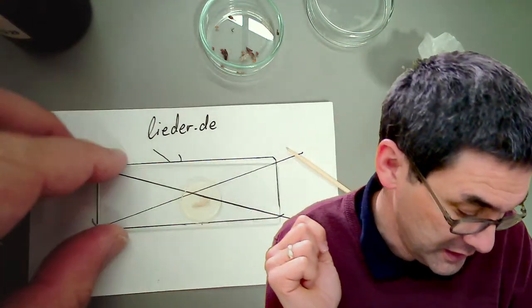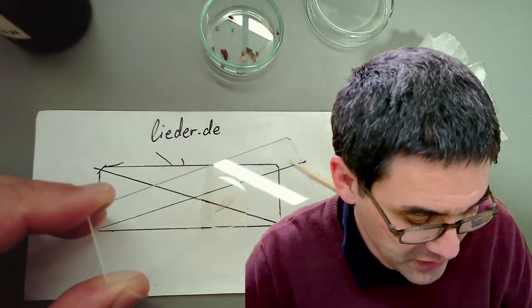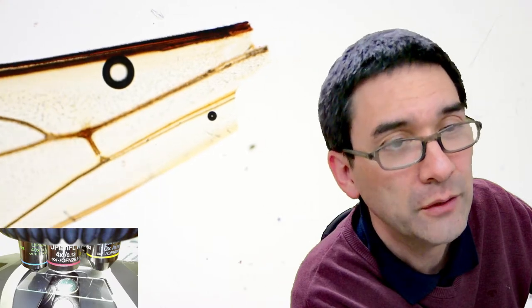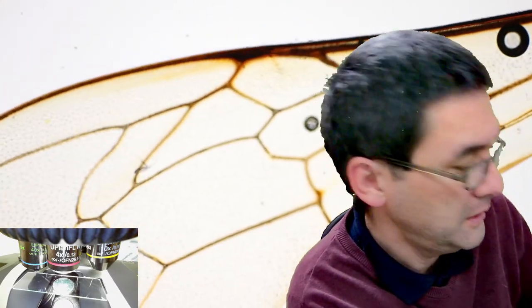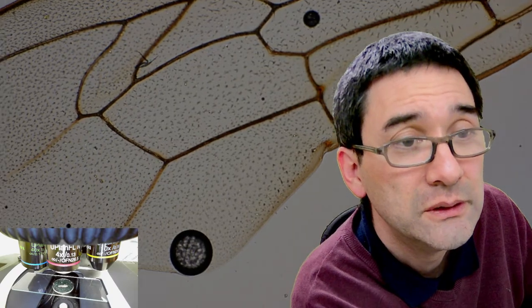Okay, so this worked actually better than I expected, obviously because the wing is relatively flat. Okay, so let me again move over here. I still cannot see the chat in OBS Studio. I'm using OBS Studio for doing the live stream, and I somehow misclicked, and then all of a sudden the chat was gone. Oh, unfortunately a bubble. Okay, and it's a little bit too bright as well. So when we close the condenser, we're able to see this. Another bubble.